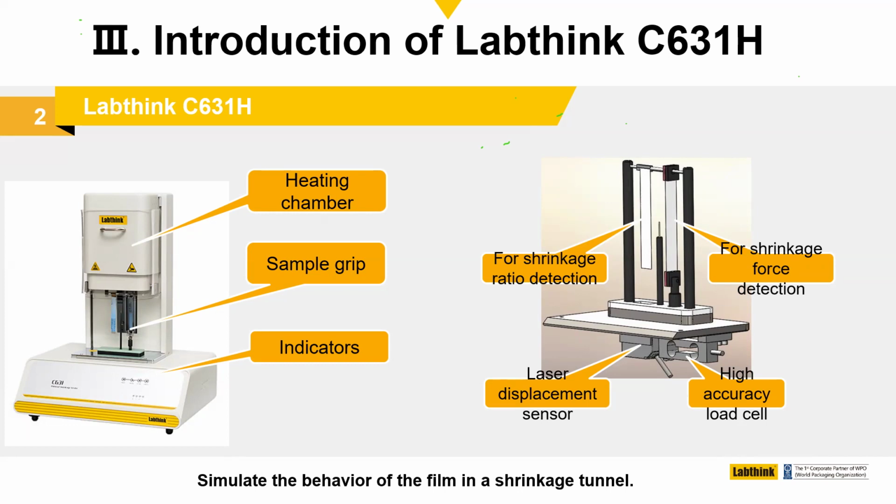So the friction that we encountered with the LVDT transducers and the cable transducer is eliminated. So this is a frictionless system, and so it provides a much more accurate and precise measurement of the change in the dimensions of the samples.